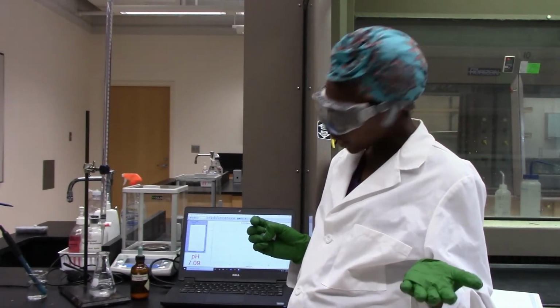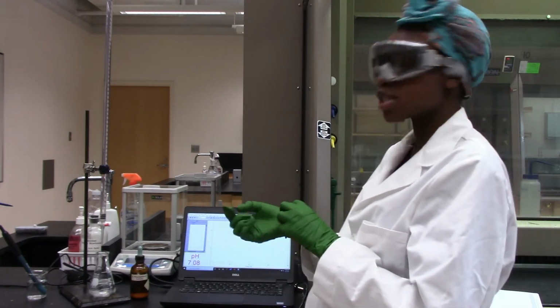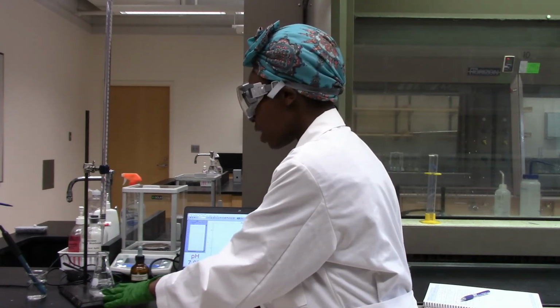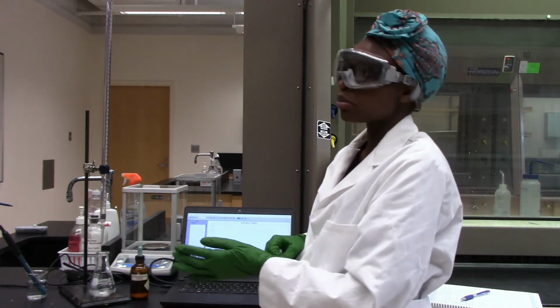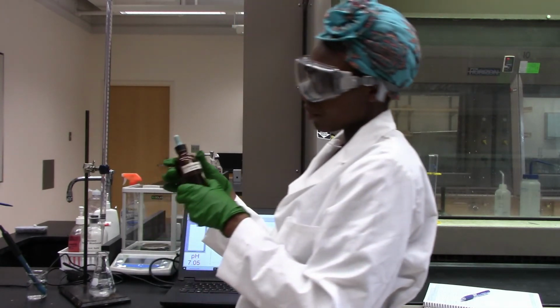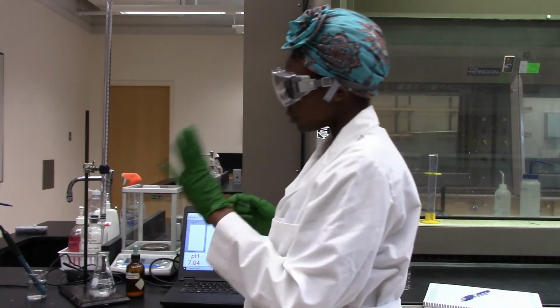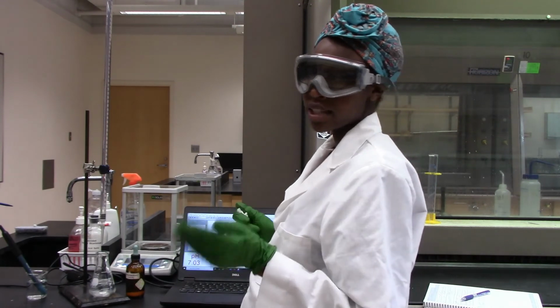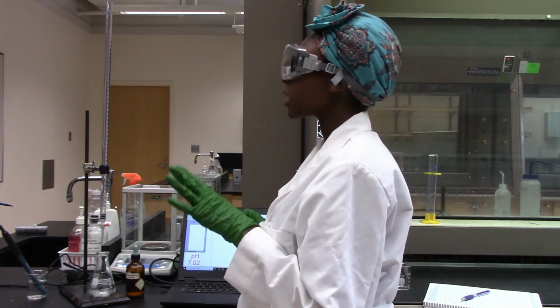So we're in part 2, which is the fun part of the experiment, where we are going to do the titration experiment. And in here I have 0.109 grams of my unknown number 1 dissolved in 80 milliliters of water. And I added 3 drops of phenolphthalein indicator. So this should tell me that when I have titrated my solution, the pH indicator will change color, and that's where I stop and find the volume of the sodium hydroxide that I used.